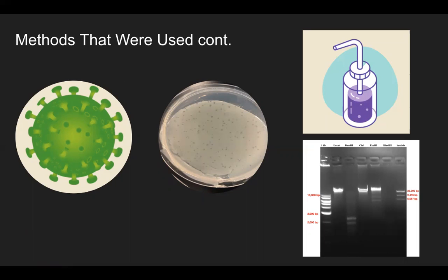Wet lab results were found using a transmission electron microscopy machine. Imaging was used to find a phage in the soil sample that was obtained by the students. The TEM imaging displayed a non-contractile tail, and the restriction enzyme digest showcased a double-stranded DNA sequence.